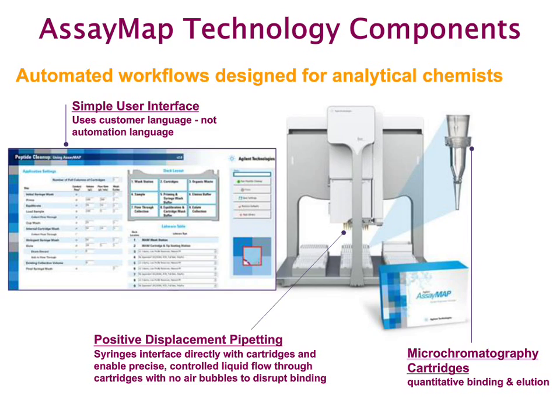The second component is the Bravo liquid handler modified with a 96 syringe probe liquid handling head that uses positive displacement pipetting to strictly control flow rates of liquids driven through cartridges. All 96 syringes are driven in unison, and flow rate can be reliably controlled down to 500 nanoliters per minute. The standard configuration also includes deck position with Peltier heating cooling station, a shaker, and a gripper attachment on the AssayMap head to move around plates during protocols.